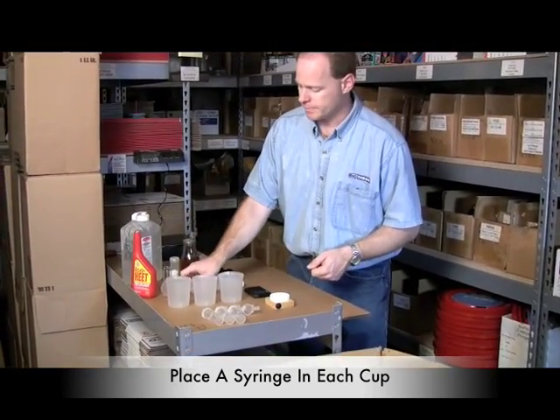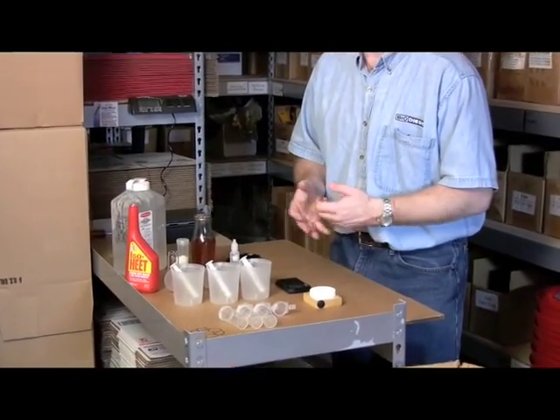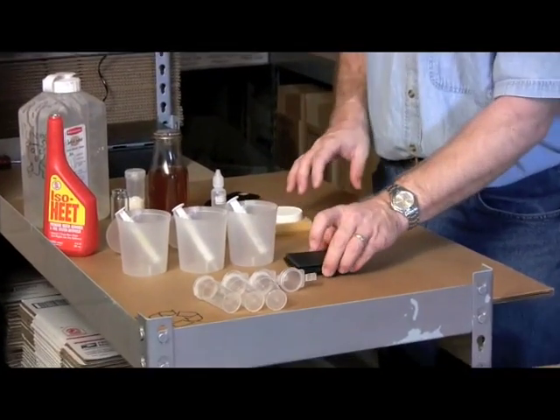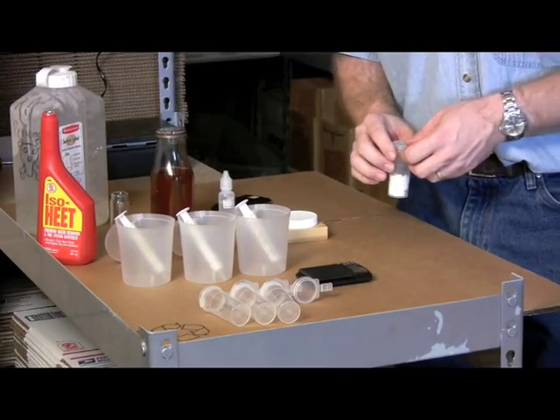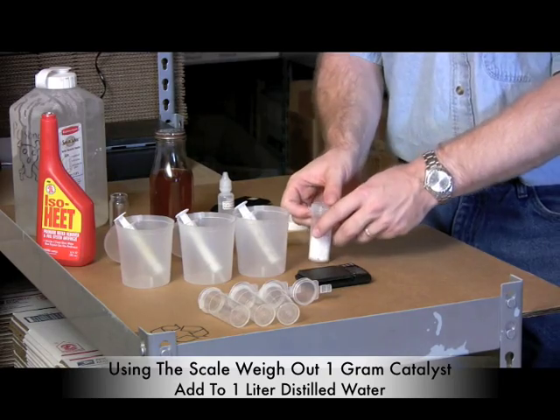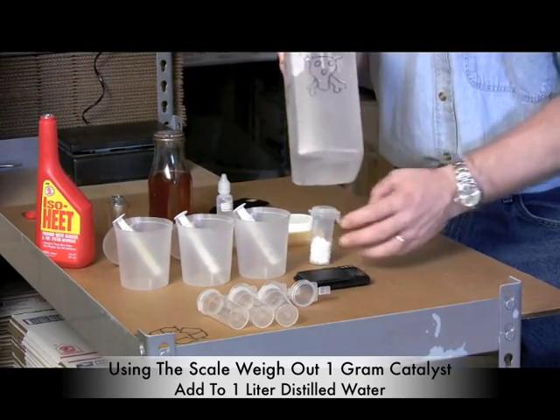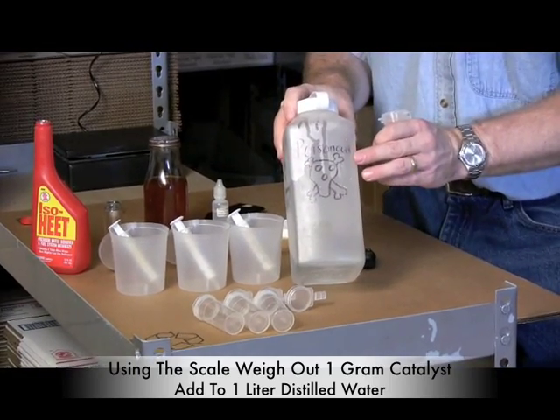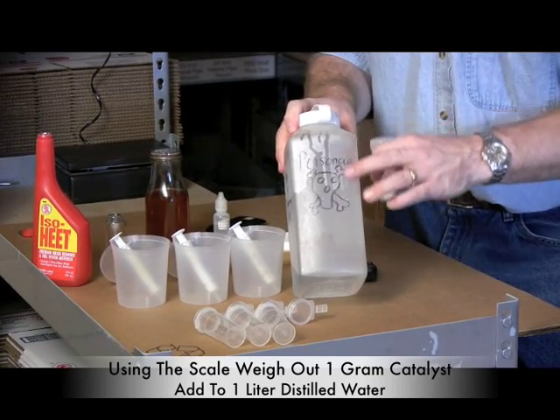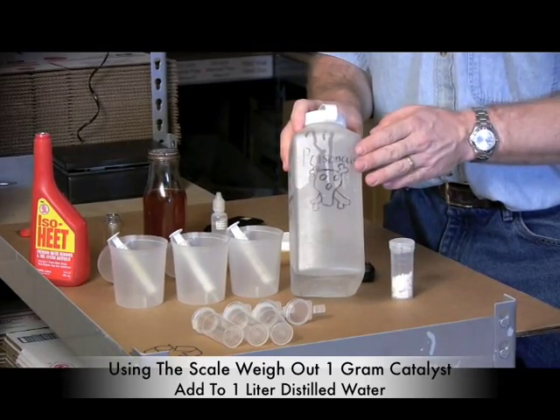First, I've got my three containers, and I like to put the syringes in each container so I know what's going to be in them. Before you ever titrate, you need to make titration solution: weigh out one gram of catalyst and dissolve it in a liter of water. This is my pre-made container with one gram of potassium hydroxide in a liter of water. Make sure you mark it as dangerous, especially if it's in an area where someone might pick it up.